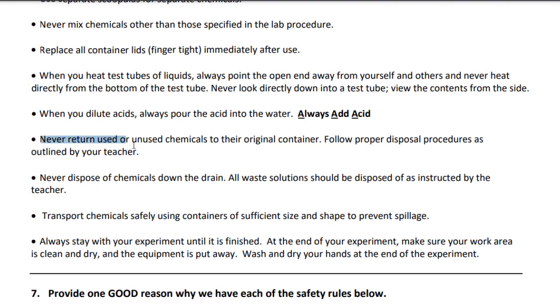If you take something, so you've used your little scoopula, you've thrown some powder into a beaker and you've taken it to your container, it's garbage now. You either use it or we throw it away, okay? We never, ever bring it back to that original container, because what ends up happening is you end up contaminating the original.